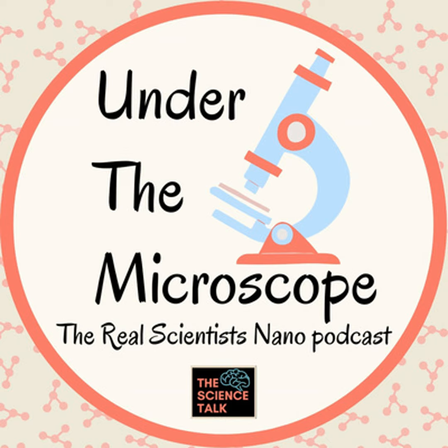So let's start by understanding your work. Could you explain your research to us in super simple words, please? Okay, I'm an imaging scientist, which is a general term for people who mess around with microscopes and other imaging platforms. In my case, what I've done across my career is build microscopes or manage microscope systems that are used for imaging, usually biological samples. So it's usually looking for activity going on inside of cells.